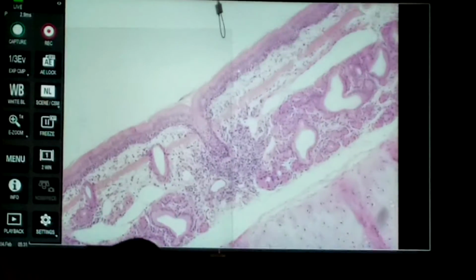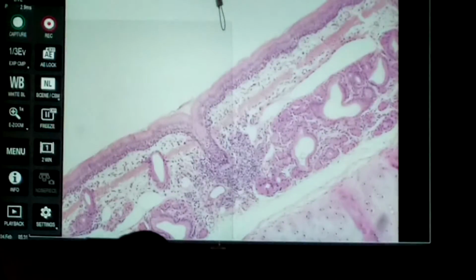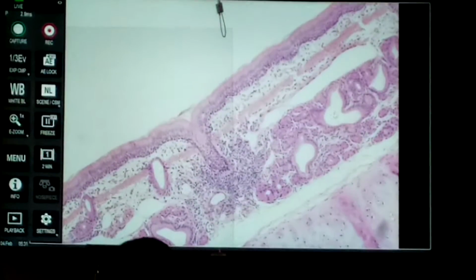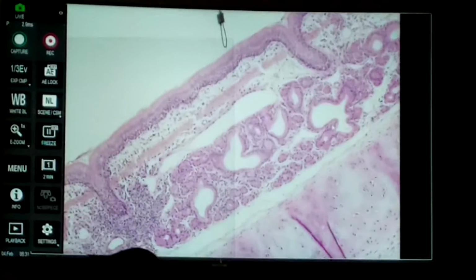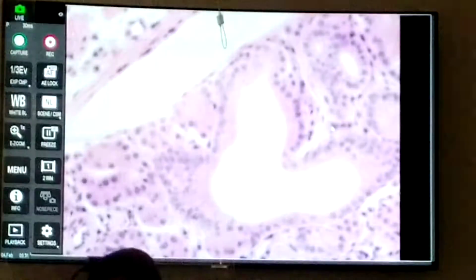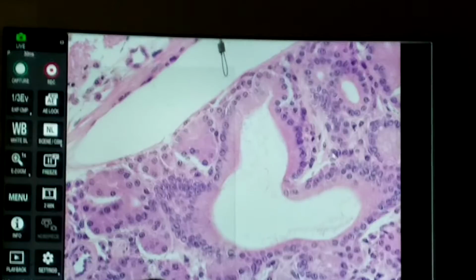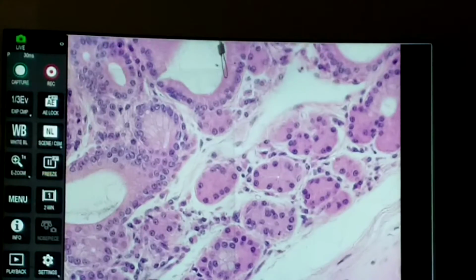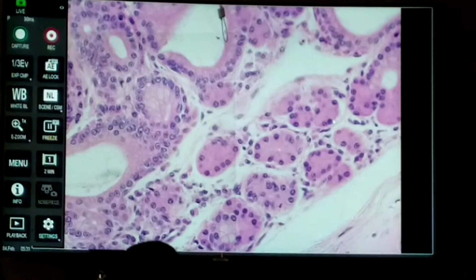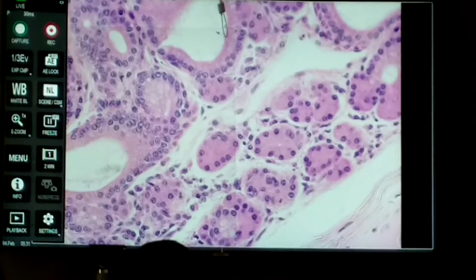Now, I was showing Victoria that there are a lot of glands down here. Now, these are not blood vessels. I know that these are glands because they don't have a simple squamous lining. The lining cells are thicker, a little more cuboidal, or in some places almost even columnar. Okay. Look here. This is a cut secretory unit.